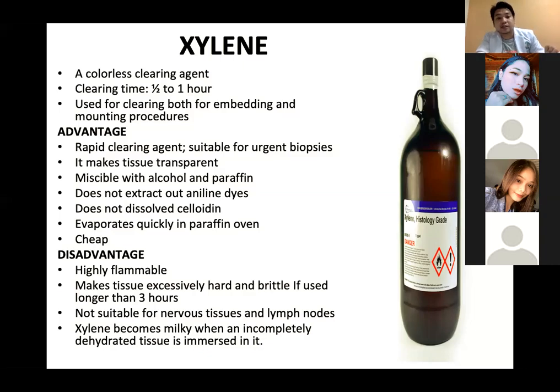Xylene does not extract out aniline dyes. It does not dissolve celloidine. It evaporates quickly in a paraffin oven, and it is cheaper compared to other clearing agents. But xylene also has some disadvantages.